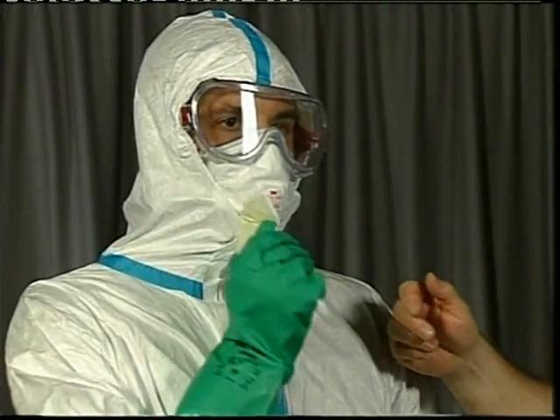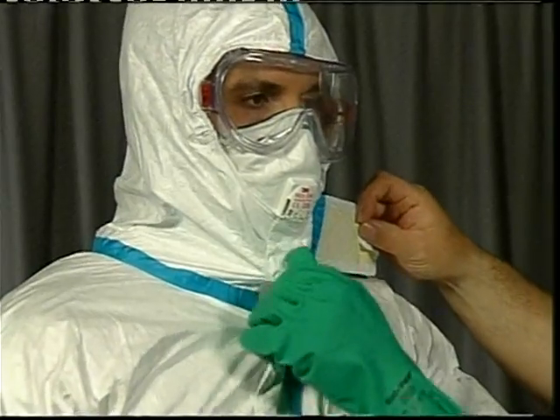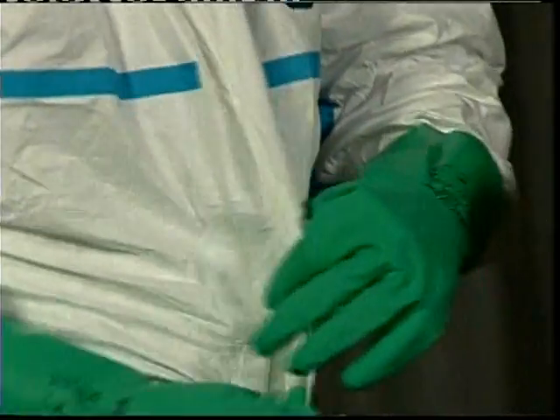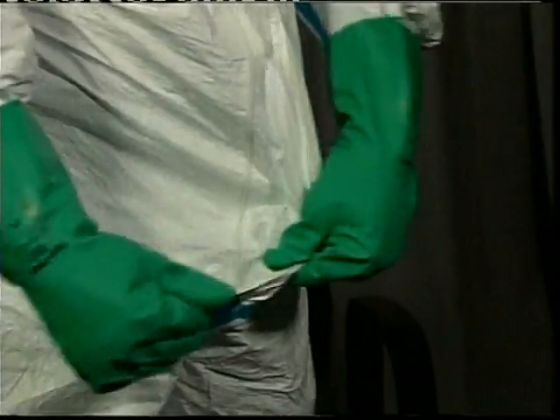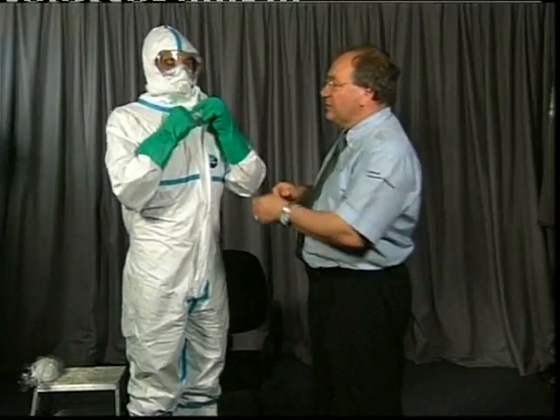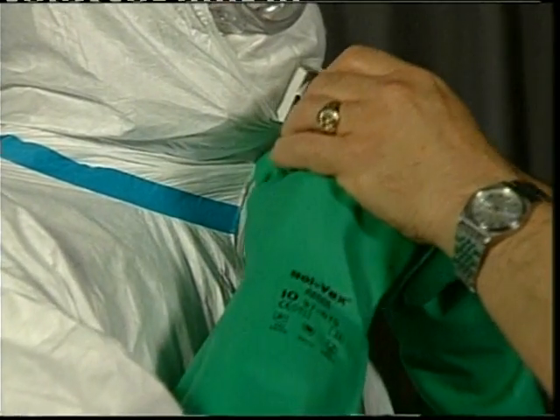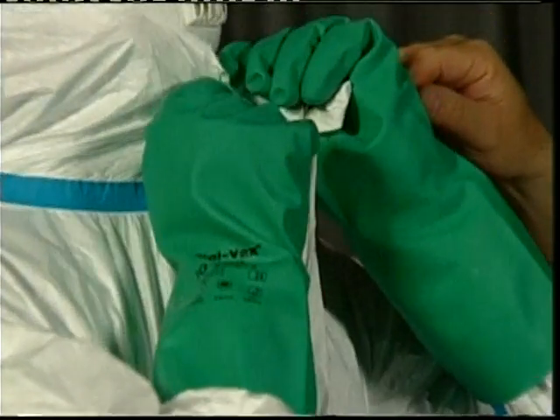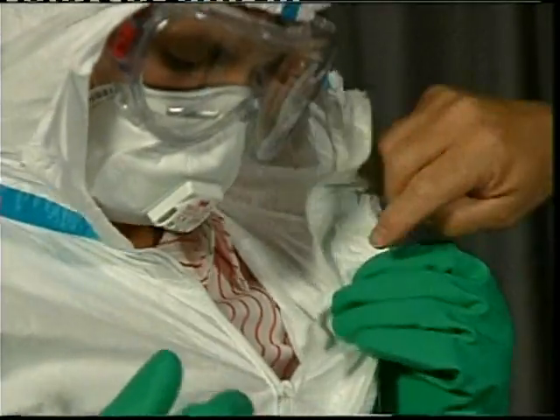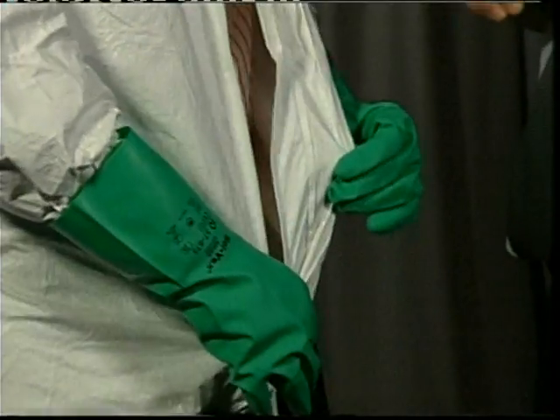First, take the throat flap away, then take the storm flap. If you have a buddy system, the person helping to undress should have at least a pair of gloves and some level of cover. Pull the flap hard and put your finger under the zip. Make sure to take the zip and pull it all the way down. Don't put your hand inside the garment because you could be putting contamination inside. Stay on the outside at all times.